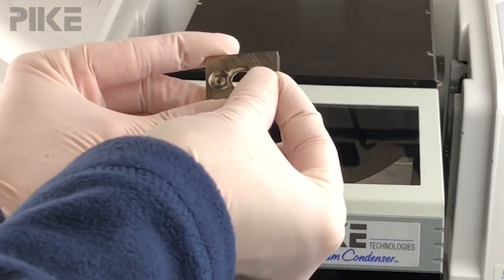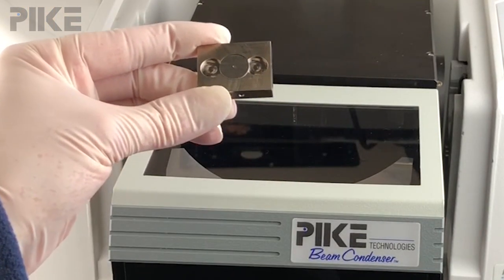To take a look at the performance of a 6X beam condenser, I collected a 100% line through a one millimeter aperture and compared that using our 6X beam condenser versus a sample holder just in the sample compartment.